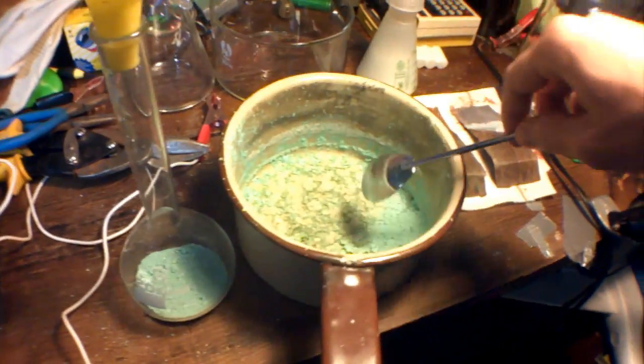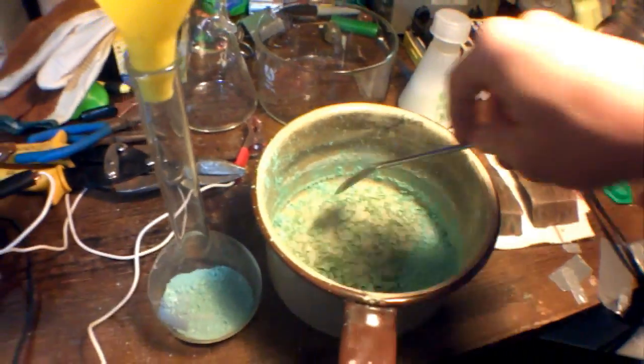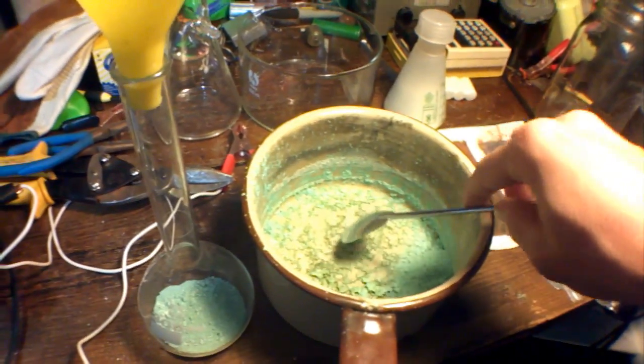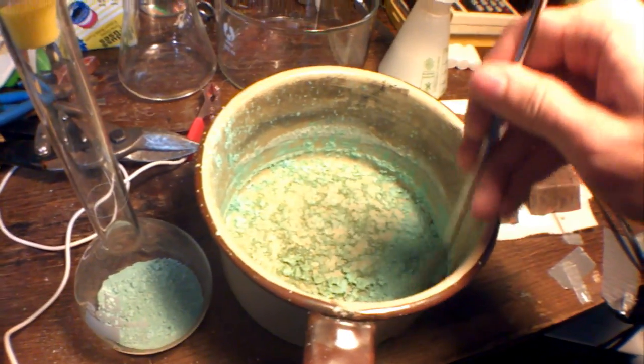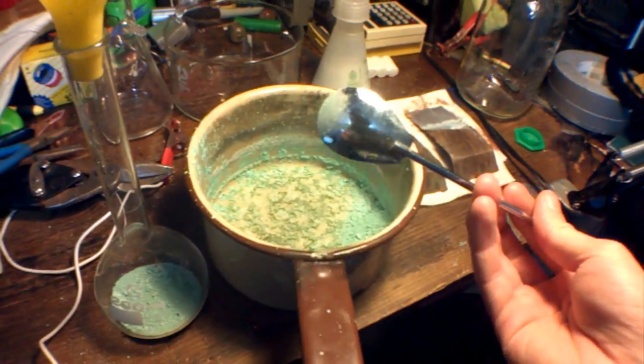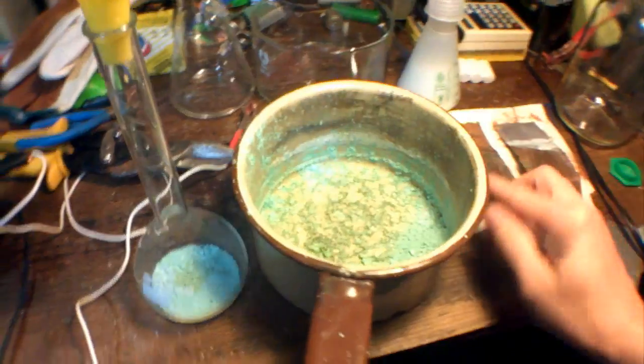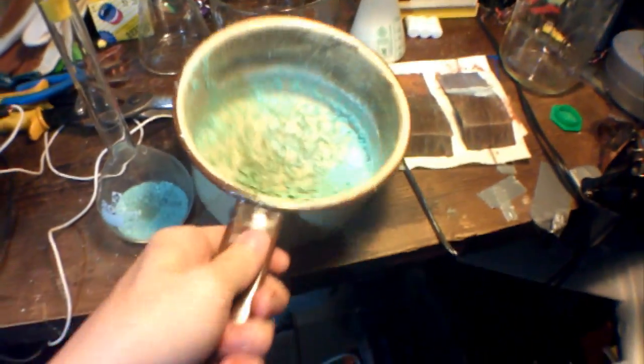I crushed the copper hydroxide. First, I scraped it off, trying not to get much of the copper oxide—the dark green stuff. Then I mashed it up against the side with the blunt side, and that broke up a lot of the chunks and reduced it to a nice little powder.